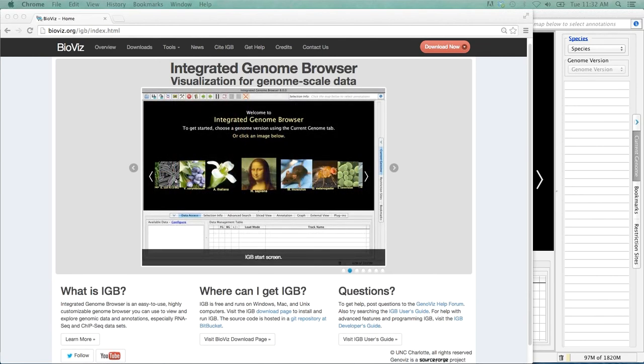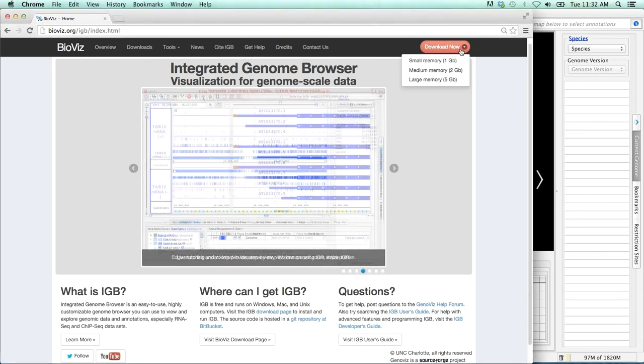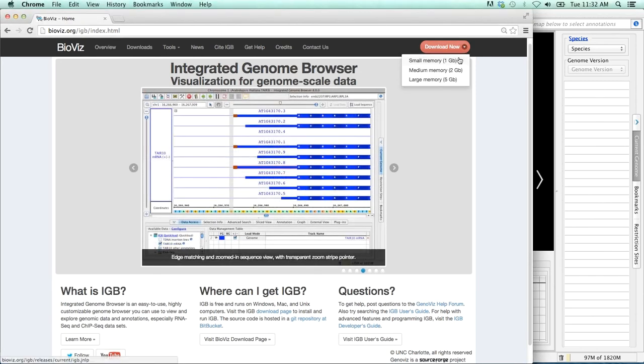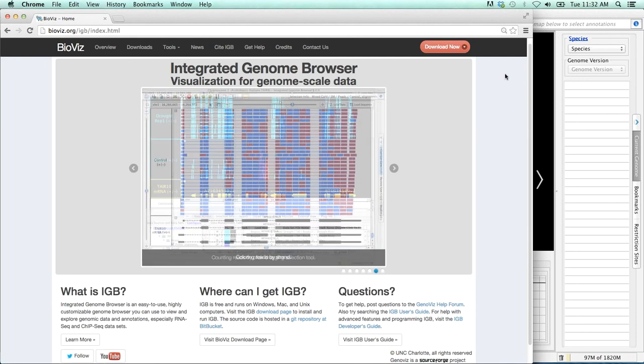So first off, how to load and start IGBE. To download IGBE, go to bioviz.org and follow the links labeled Download. You'll see that there are three options. Usually the medium memory option is the best option if you're using a computer with between 4 and 8 GB of RAM. Also keep in mind that you'll need to have Java installed.